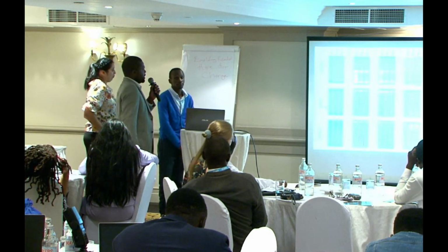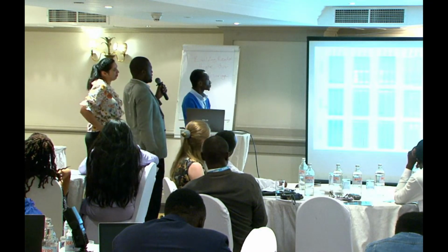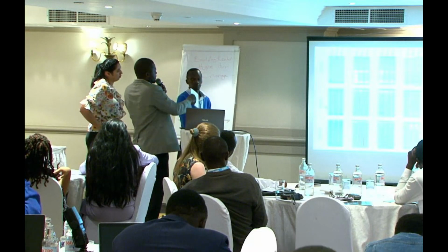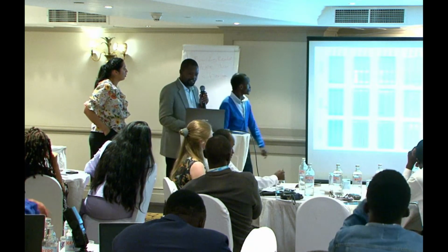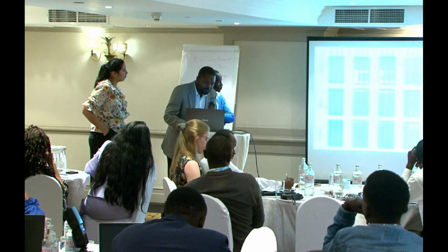So this is a peak of the HPTLC. We try to develop the fingerprint. We can see the leaf. This was the leaf, and then we had this low polarity.